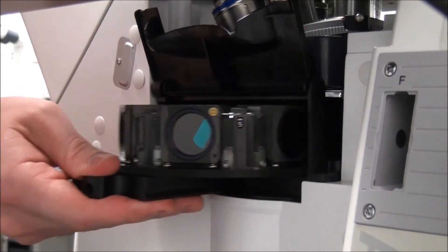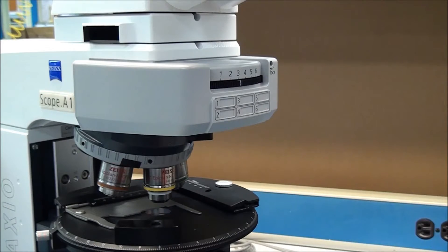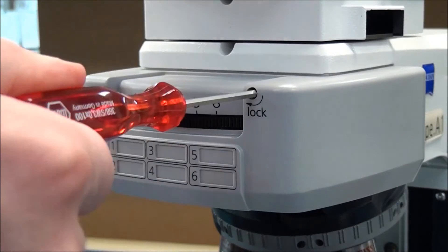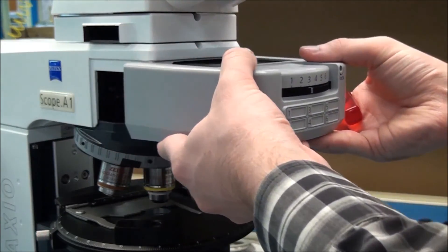Slide the reflector changer completely out. On Axioscope A1, the reflector changer must be completely removed to access the reflector modules, except on the FL LED version. Remove the module by loosening a 3mm hex Allen screw as shown.